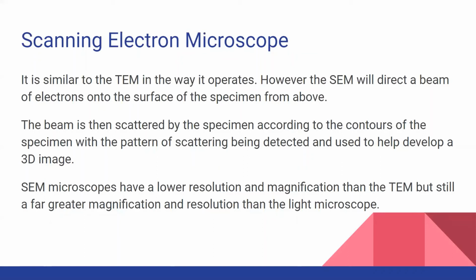The SEM microscopes have a far lower resolution and magnification than the TEM microscope, but they still have a far greater magnification and resolution than the light microscope.